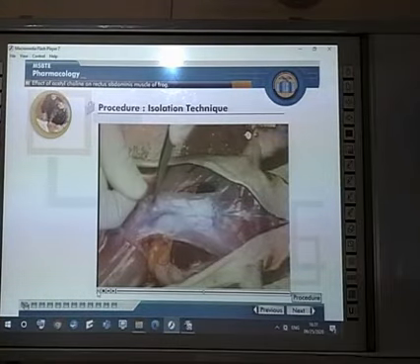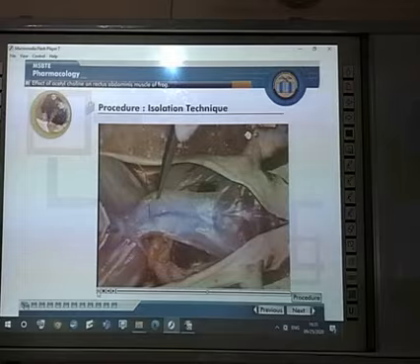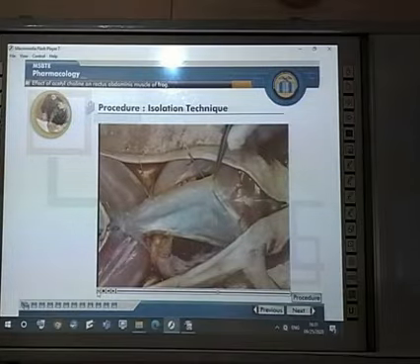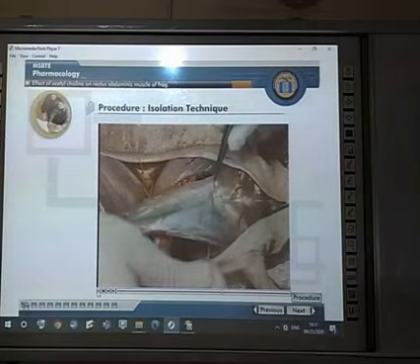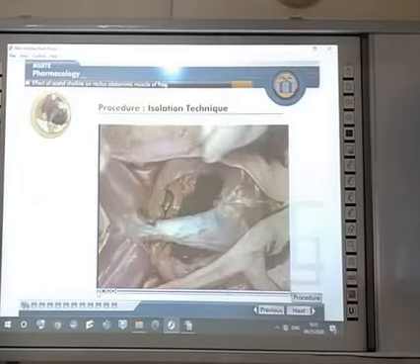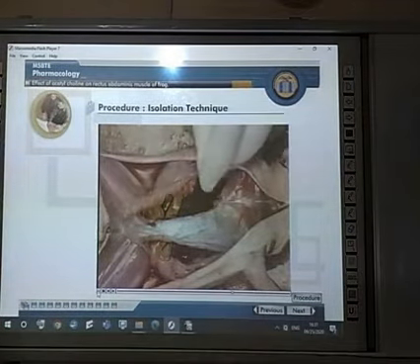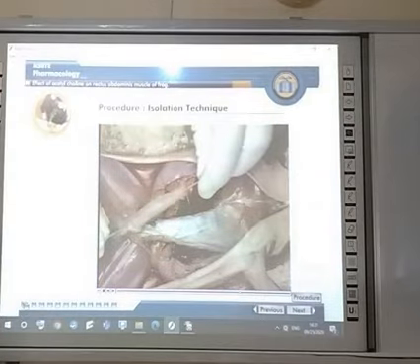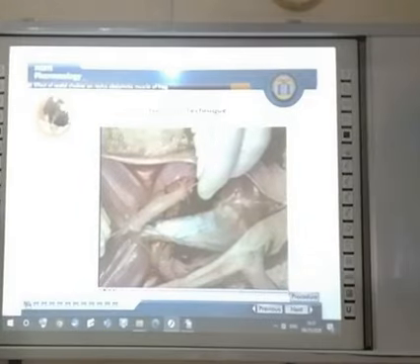Now, tie a thread to the bottom and top of the rectus muscle before removing the muscle from the body of the frog. Mount this rectus muscle preparation in an upright position in the organ bath containing frog Ringer solution under a tension of 1 to 5 grams.